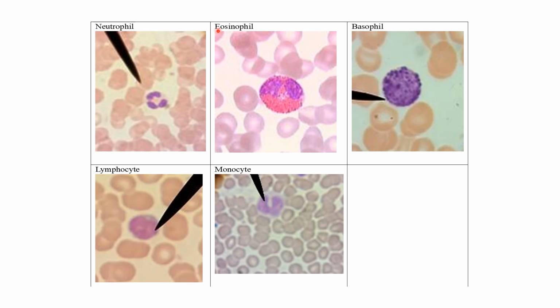Then in this slide, you can see an eosinophil. Again, orient yourself. These are RBCs with paler centers and darker rims, and this larger cell over here is an eosinophil. It has two lobes. Eosinophil is bilobed, and the granules are reddish. Then in this blood slide you can clearly see the RBCs, and this is a basophil. Basophil has a bilobed nucleus, which is not very prominent because the granules are also blue.